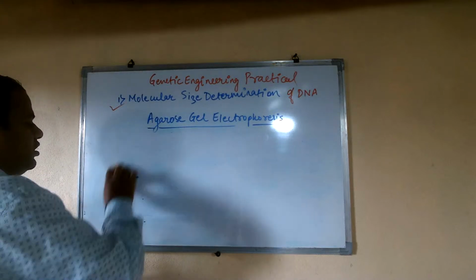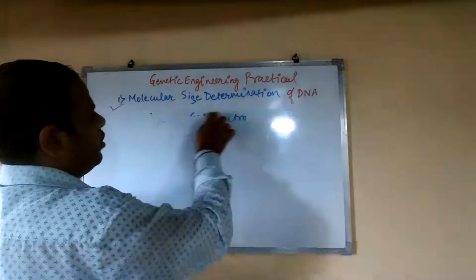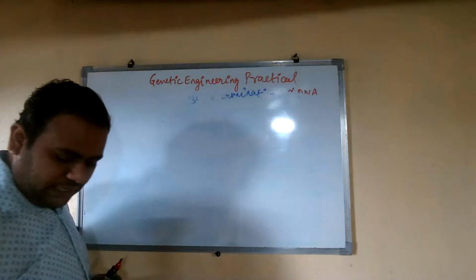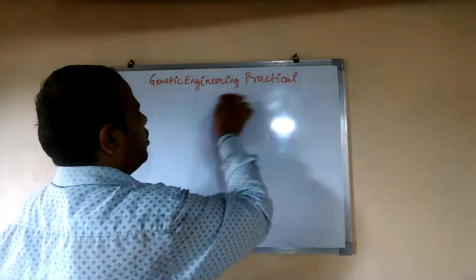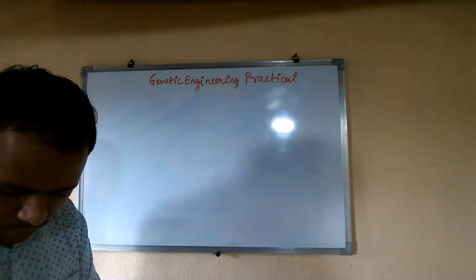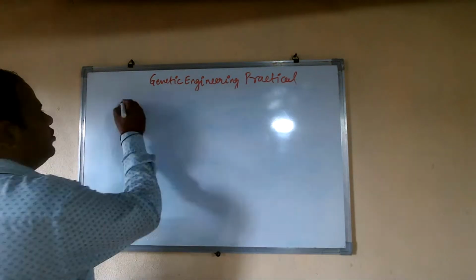Then we are going to discuss the next one. Actually, next is western blotting, so let's proceed with the western blotting.